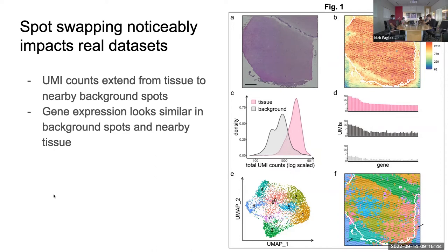They also have different ways to depict this effect, like in density plots. Concerningly, the gray density plot here — we shouldn't have any expression ideally, or any counts, in the background. So that's already a concern, and we have some overlap between tissue and background.